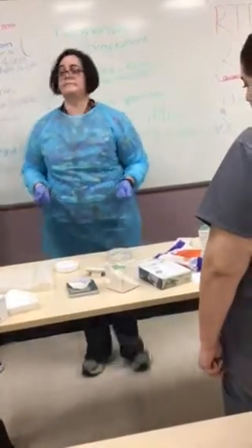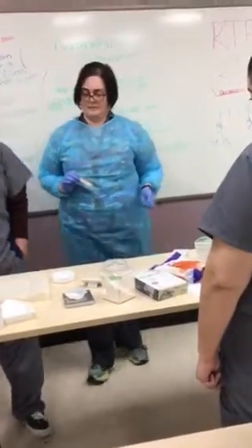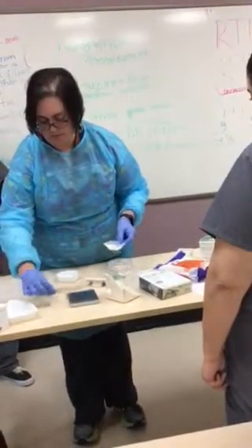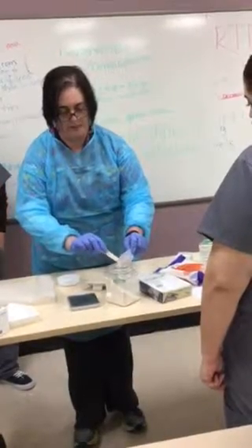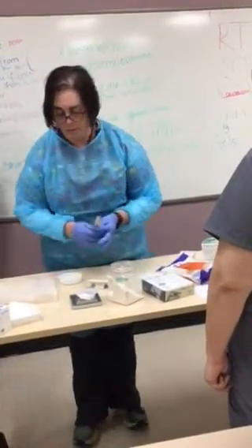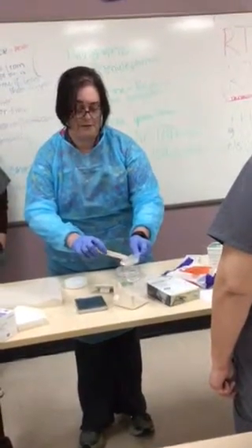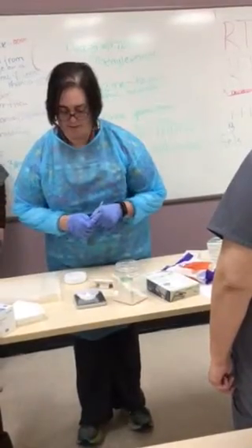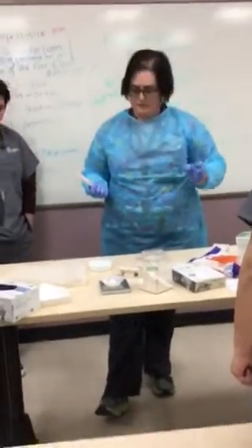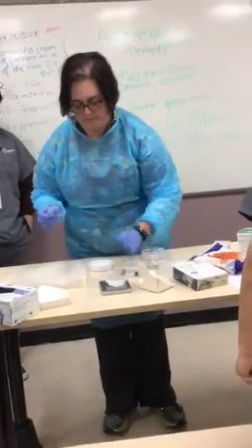So I have 8 grams on there — you see how much 8 grams is? I want to make sure I don't get anything on my scale because that will change my measurements. So I'm going to pour this out. And I'm at 4 grams. When we do the weighing next week, you'll see how much fun it is. So I'm at 3.7 grams. Let's take a little bit out of here. Let's see if I'm at 3 or close enough to 3.